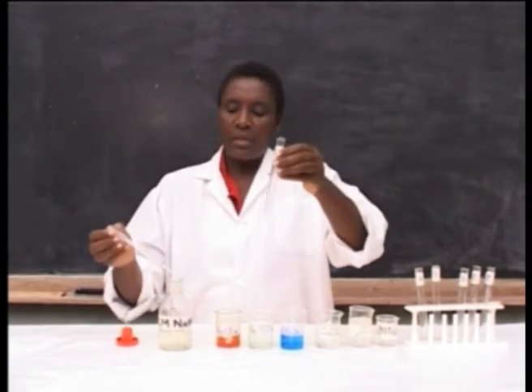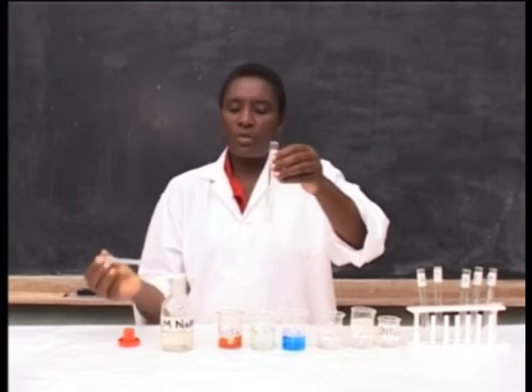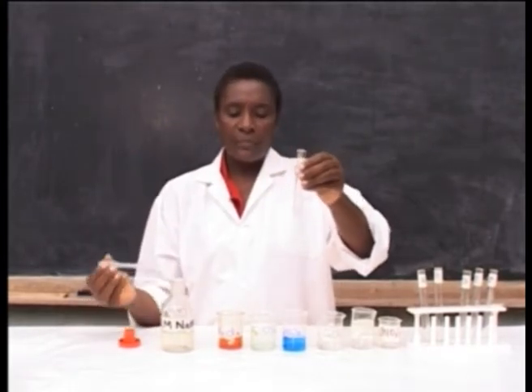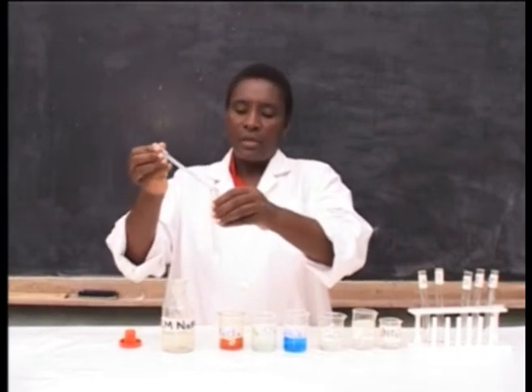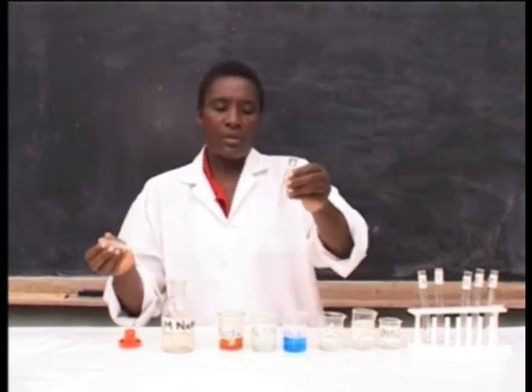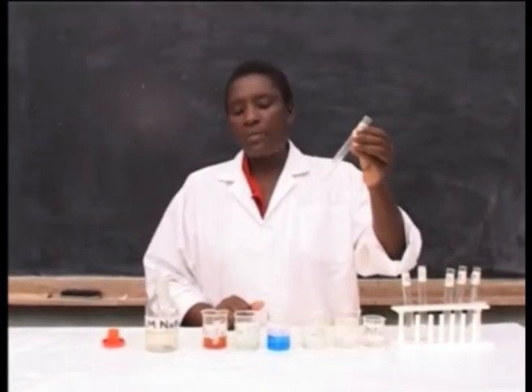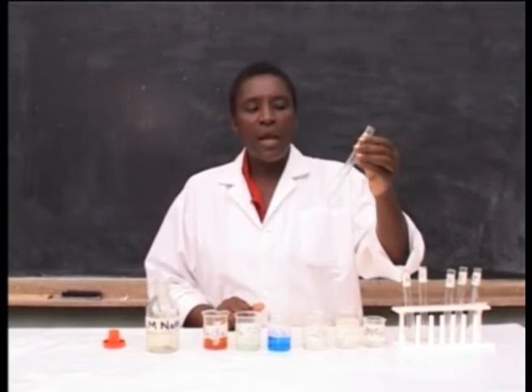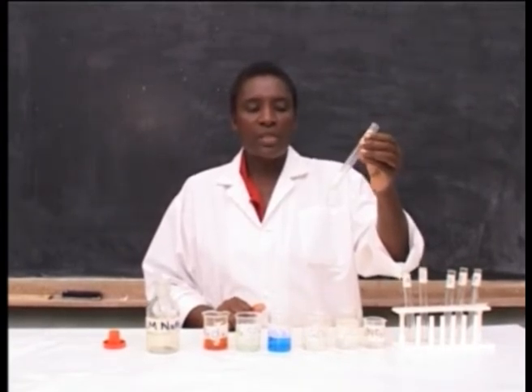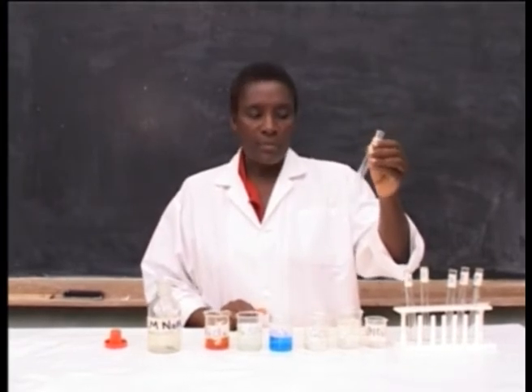After that, add more sodium hydroxide and observe changes. In excess of sodium hydroxide, there is a formation of calcium hydroxide, which is insoluble in excess of sodium hydroxide.